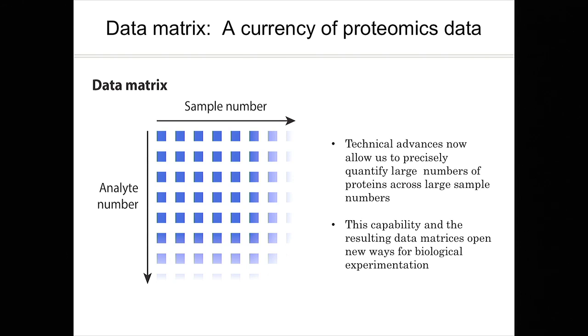So let me start with this slide. I think the big difference from the techniques we are learning and discussing this week is that it now allows us to generate data sets which look like a matrix. This matrix would be samples, these are biological samples, and then on the y-axis are proteins that are measured, identified and quantified in each one of the samples.